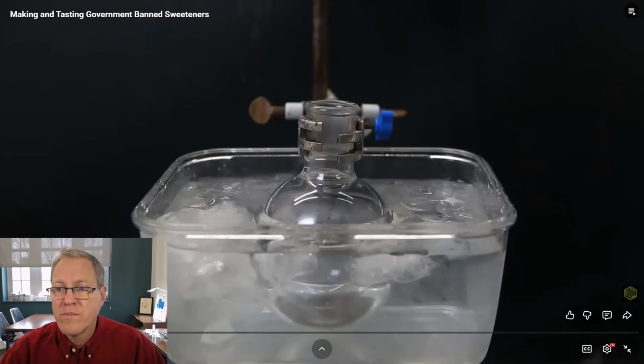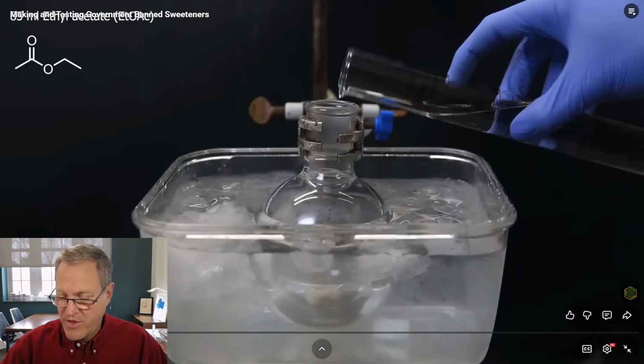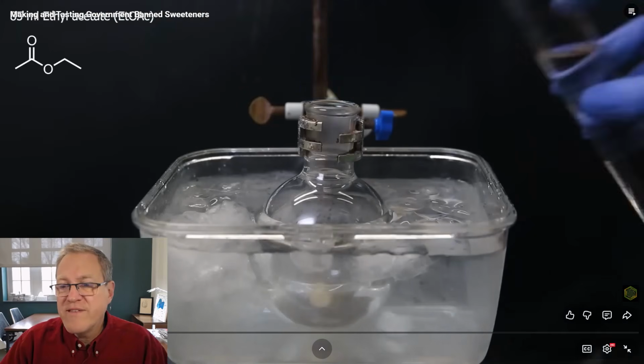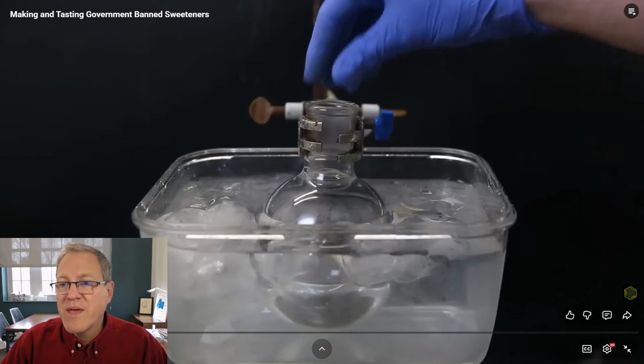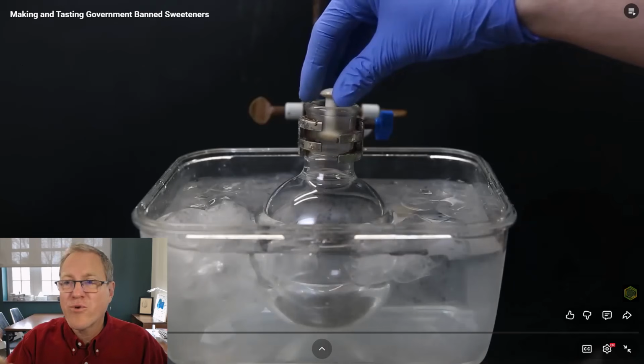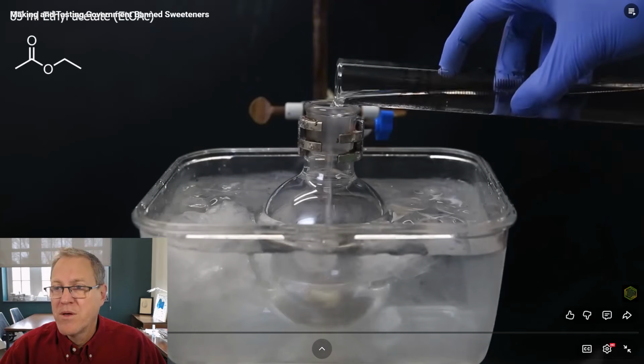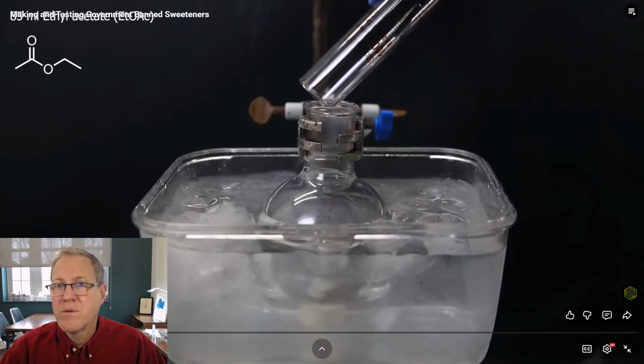So to get started, I set up a flask in an ice water bath and drop in a stir bar. This is an interesting stir bar. I've seen this type of stir bar before, kind of a dumbbell stir bar. I'm used to just the oval or egg-shaped stir bar, so that's kind of neat to me. I add 85 ml of ethyl acetate as a solvent.